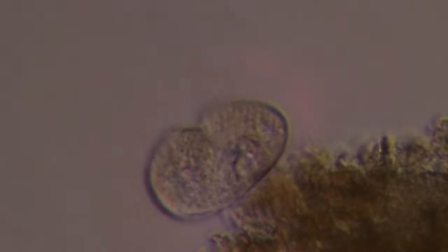Since he's really there, let me zoom in again with some more detail. And you guys saw this one the other day with the big vacuole. There's the contractile vacuole doing its business. Nice 3D rotation. Maybe a little more light in there. Wow, this guy's really active. Whoa, whoa, whoa.